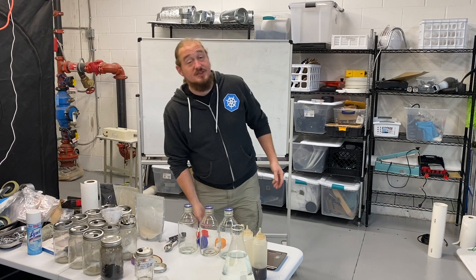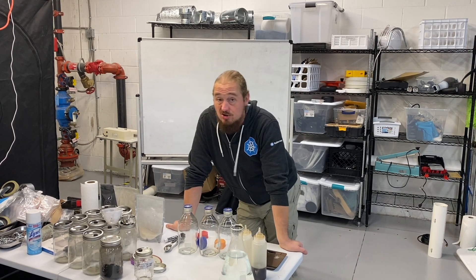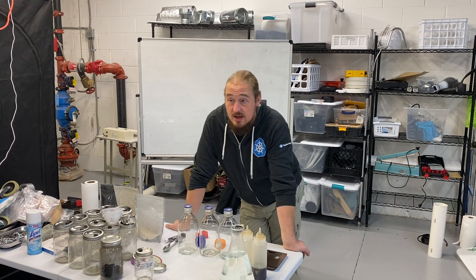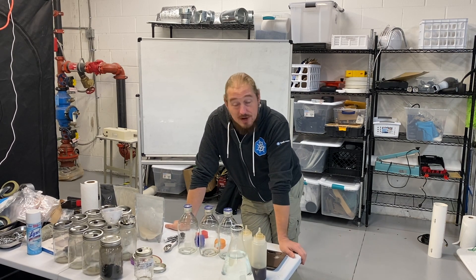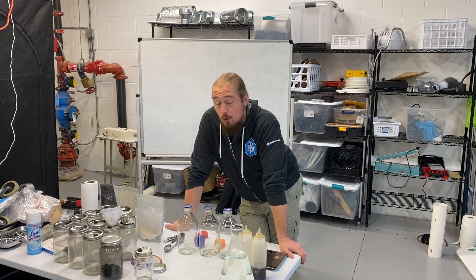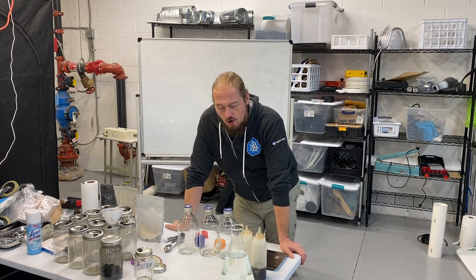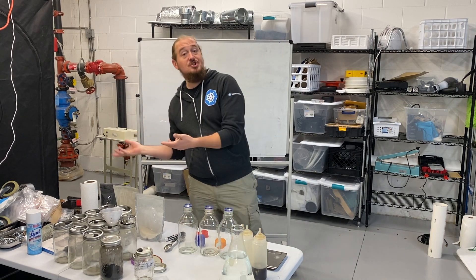Good morning everyone, Jesse here with the Humble Fungus. It's a cold and dark Tuesday here in Colorado, but I've been doing a lot of agar work recently — genetic culture work — and I get a lot of questions. They're great questions about recipes and sterilization times, but a lot of them are coming into the middle of the actual topic.